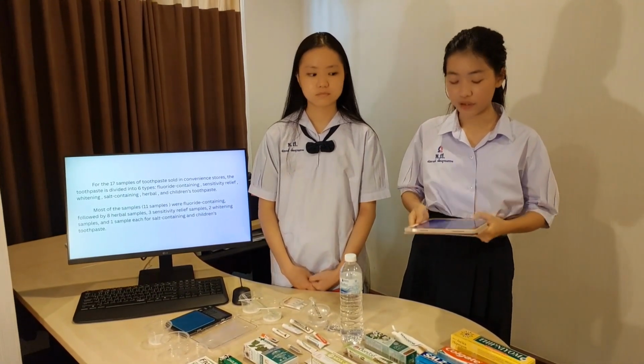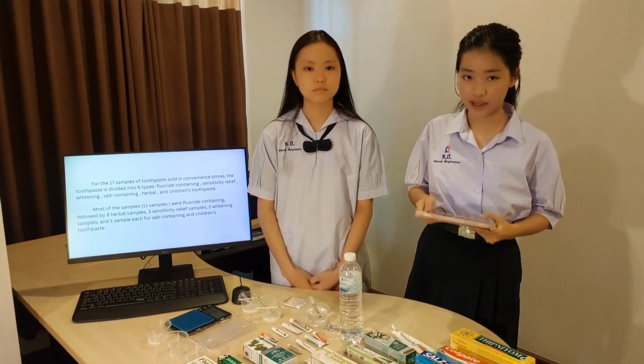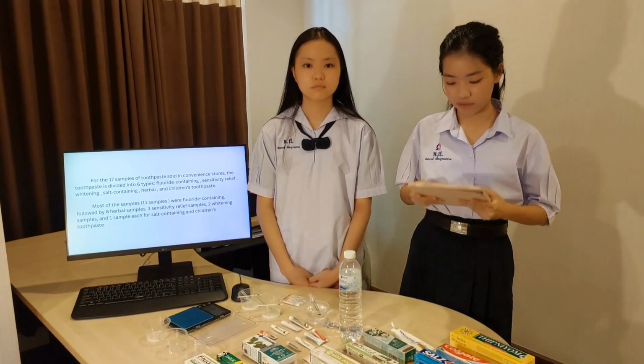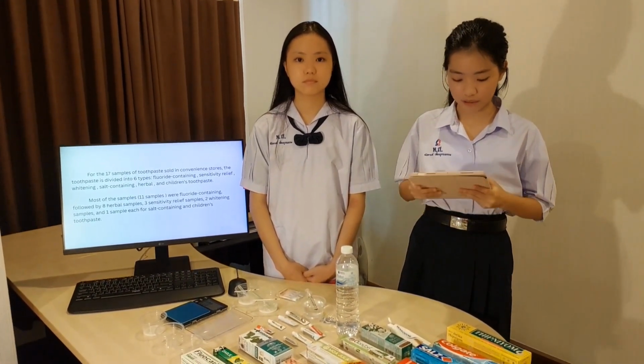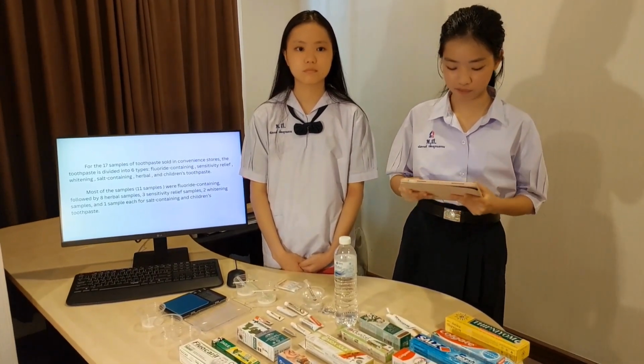Most, 11 samples, were fluoride containing, followed by 8 herbal samples, 3 sensitivity relief samples, 2 whitening samples, and 1 each for salt containing and children's toothpaste.